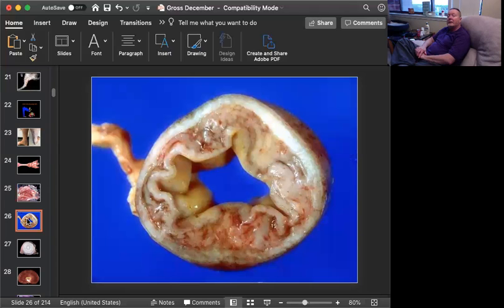Question number 3 is tissue from a foal. Can you give me a morphologic diagnosis, the cause, and how about a clinical pathologic finding?